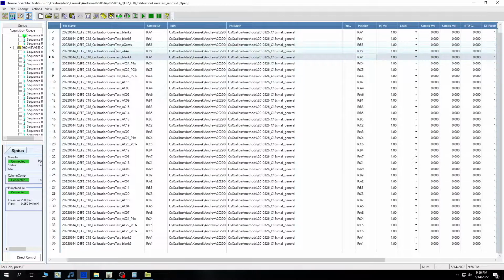A quick last thing that I haven't shown here, you will probably want to add a little uniquifying letter or number on each non-unique pool injection, otherwise they'll get this sort of ugly timestamp in the results file, so you know, P1XA, P1XB, etc. That's pretty much it.